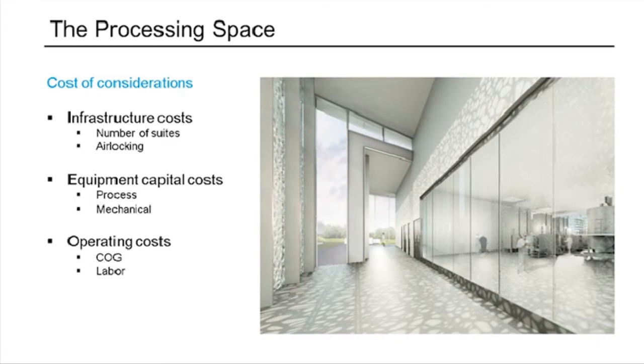And then there's, not listed here, but certainly facility operational costs, things like utility sampling, room viable monitoring, all of the labor that goes on, certainly quality and quality checks, all of the labor that goes on to support the operations on the whole. And so in terms of being cognizant of maximizing your facility value, there's a number of different things.